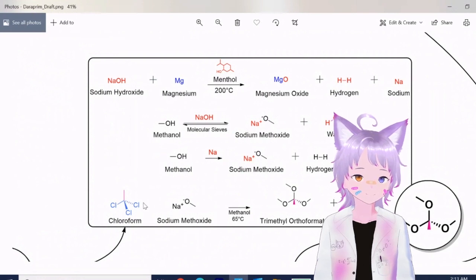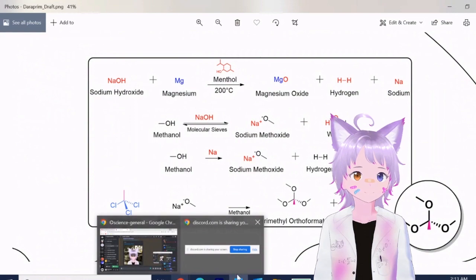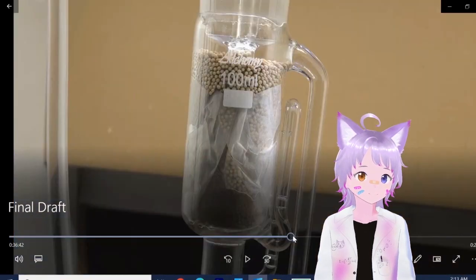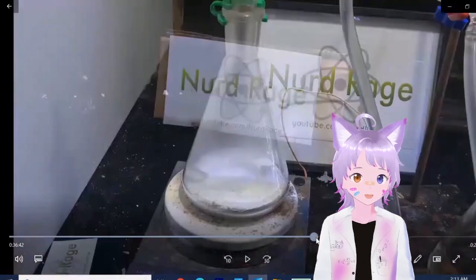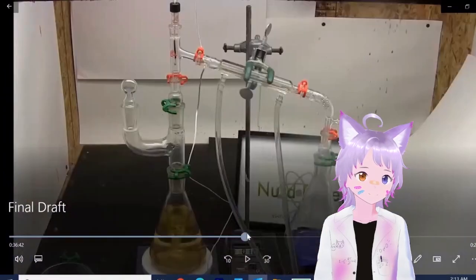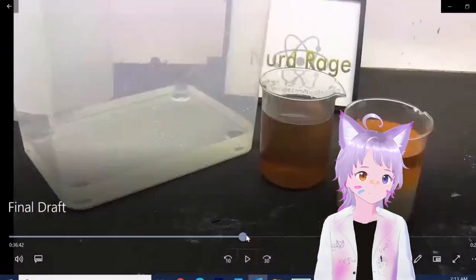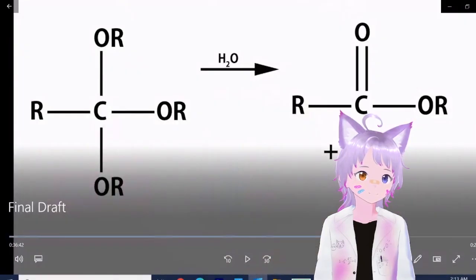Anyhow, yeah, back to this chloroform and sodium methoxide reaction. Well, you actually saw what happened to it, right? Like it just boiled out of control and just popped. Oh yeah, it was funny. I actually have it here. Where is it? Okay, right here.